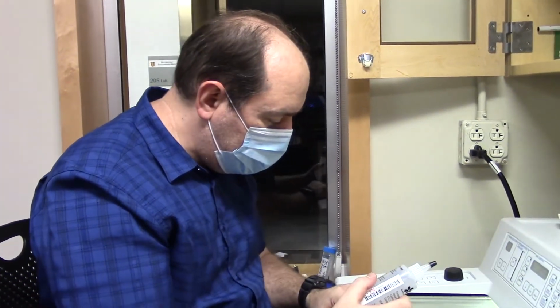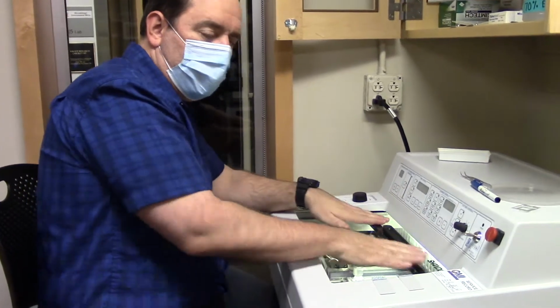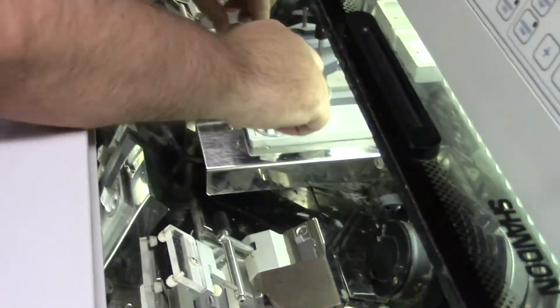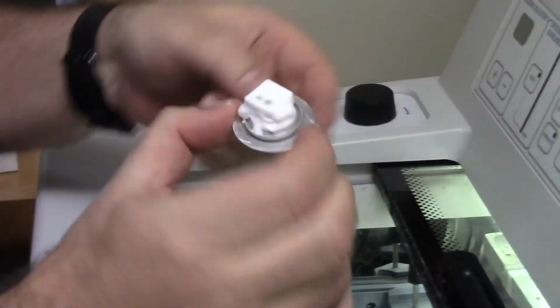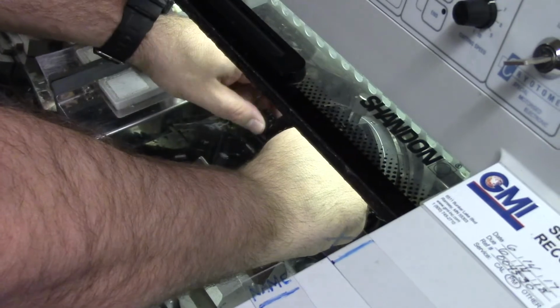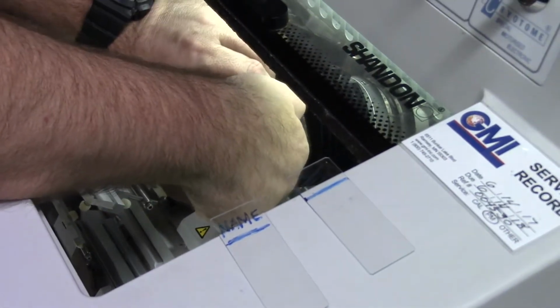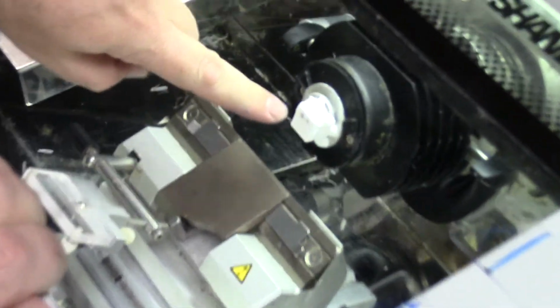So we'll give it just a minute to freeze, and I'll put the OCT back in the refrigerator because we are done with it. So I've got our window open. Let's reach back in here and turn the Peltier cooler off. And here's our frozen sandwich with peanut butter spread all the way around the outside to make sure the sandwich never falls off. I'll place it in the chuck holder and tighten that down so that the chuck cannot move in any direction. Notice I've got my two pieces of tissue.